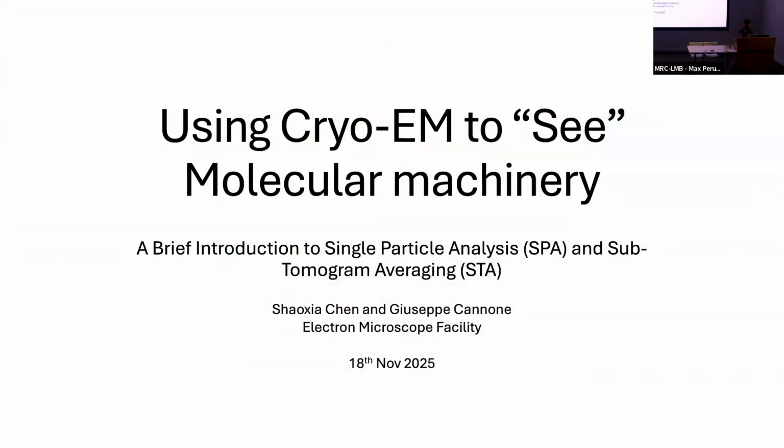Yeah, thank you, Steve, for inviting the EM facility to present here. We think we are one of the techniques you can count as biophysics. It's one of the microscopy techniques that can be used to see the molecule, so this is really seeing, not just calculation.